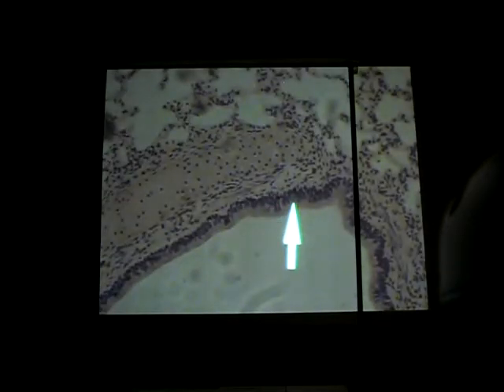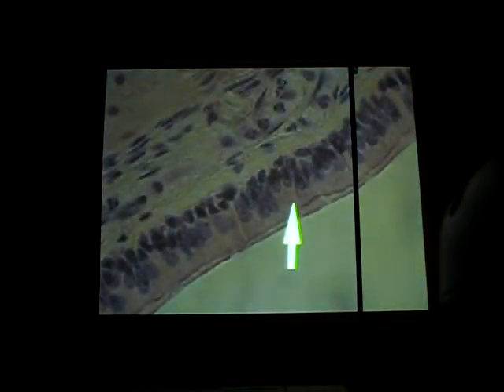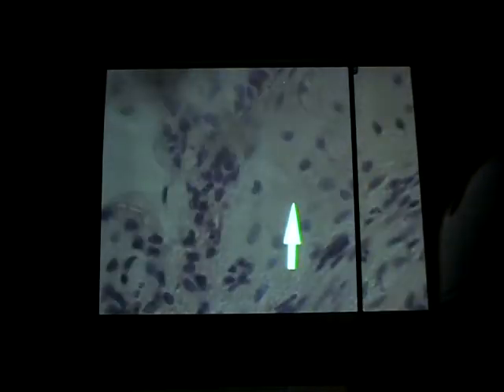All right. So with the bronchus, I could show you the bronchus on a slide by itself, similar to the cartilage. So if you're just seeing small pieces of cartilage, then we know that's our bronchus. We have our cartilage, and we have our pseudostratified epithelium as well, again the pseudostratified epithelium that we saw with our trachea. We're just seeing these small pieces of cartilage. You also have a little bit of smooth muscle as well. But the main thing is going to be the shape of the cartilage.